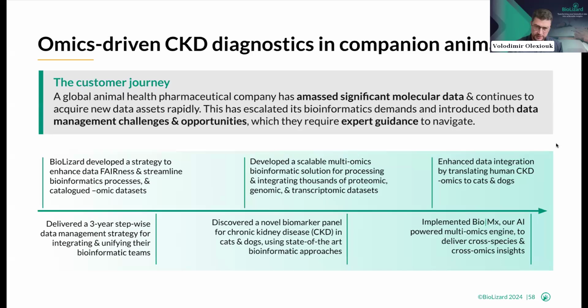One of the results there, and I'm cutting a little bit some corners here, is that we did identify the usual markers that are known from literature within our multi-omic approach, but we also identified some novel markers that brought some insights. Nevertheless, one of the issues was that there was still a lot of variability within the data, and while the majority of the results made a lot of sense, there were other parts that were puzzling researchers and the scientists.